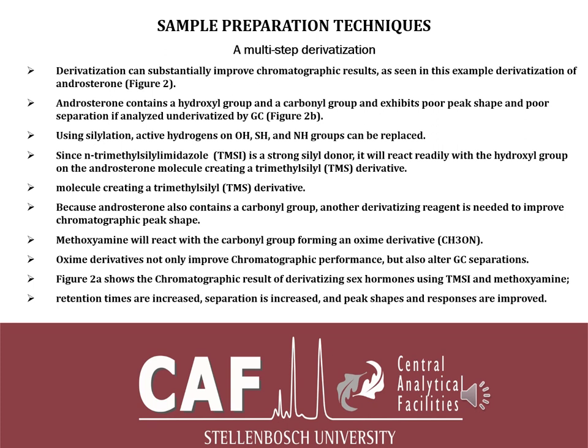If one looks at slide number 15 and 14, these explain in more detail a multi-step derivatization. Derivatization can substantially improve the chromatography results, as seen in this example of derivatization of androsterone in that figure I showed you earlier, where with derivatization the peaks were higher and sharper, including the order in which the compounds were coming. Androsterone contains a hydroxyl group and a carbonyl group, and it exhibits poor peak shape and poor separation if analyzed by GC without derivatization, as previously shown.